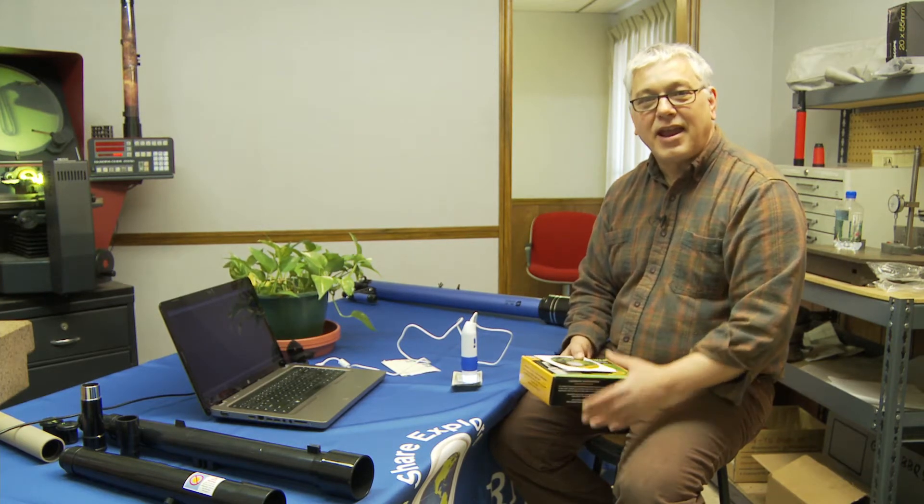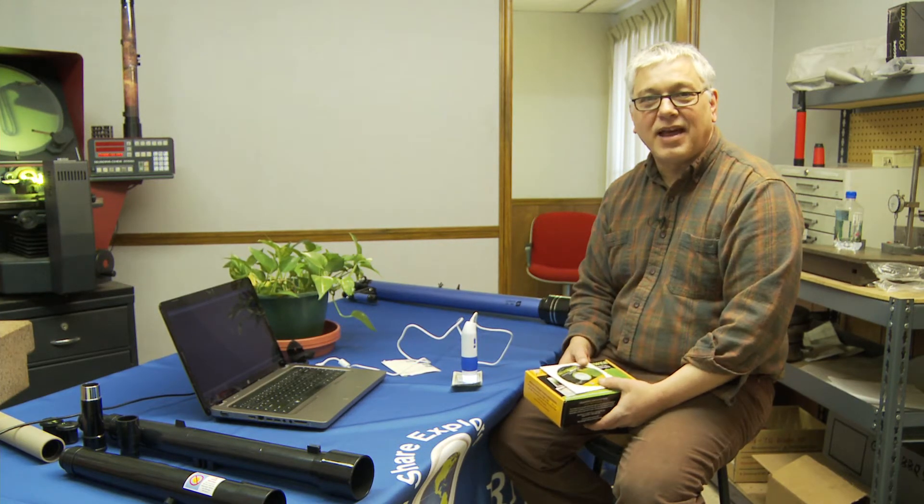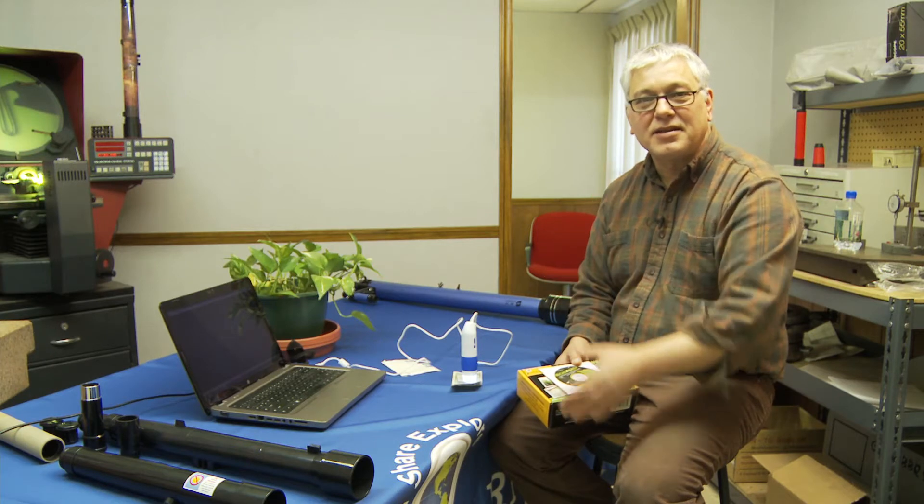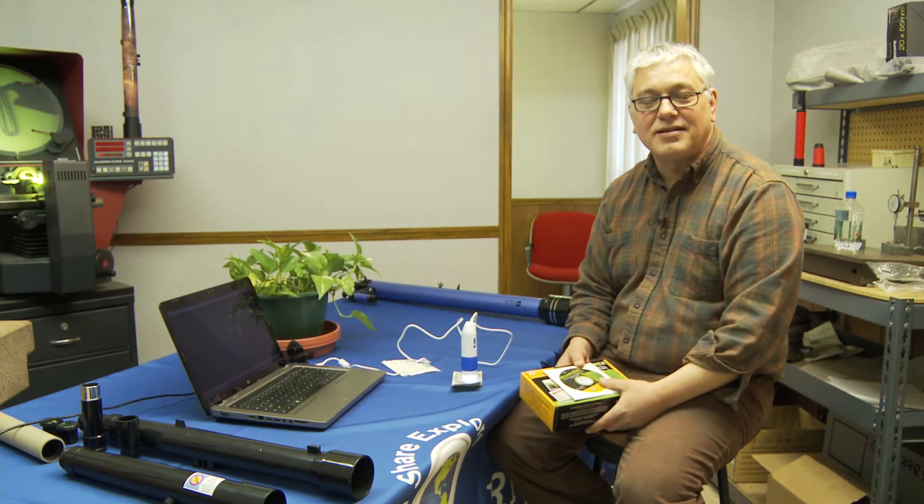which takes literally a minute, plugging your unit in and start having fun. And on our website we have a lot of experiments and things that you can do with this as well. It's great for home, classroom, it's great for hobbyists, collectors. It has just a ton of uses.